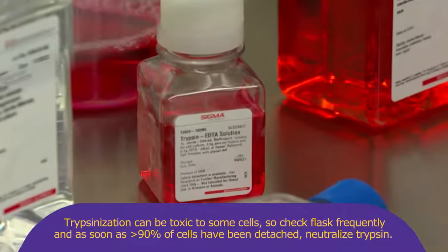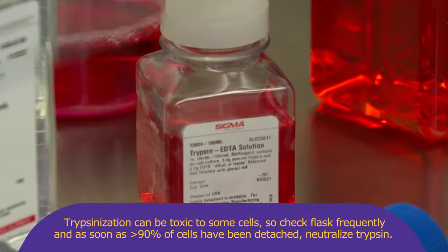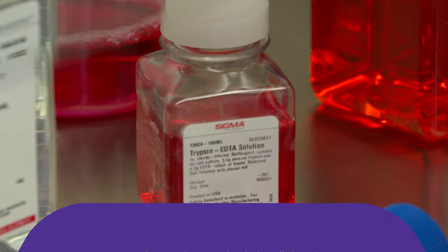Trypsinization can be toxic to some cells. So check flask frequently and as soon as greater than 90 percent of cells has been detached, neutralize trypsin. You can also tap the vessel to help cell detachment.